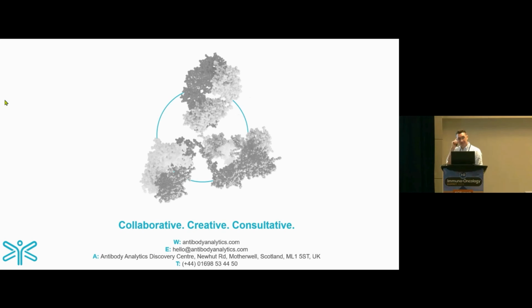Nice to see the range of assays you have. Very comprehensive. Patients aren't healthy donors. So what's your feeling about getting enough healthy donors to hopefully represent what's happening in patients? Is it feasible to get patient samples, PBMCs, for example? I'm not quite sure if I heard you properly, but are you asking, can we look at patient material and do predictive work in your assay? This is actually something that we would really love to do. That would be our main goal.